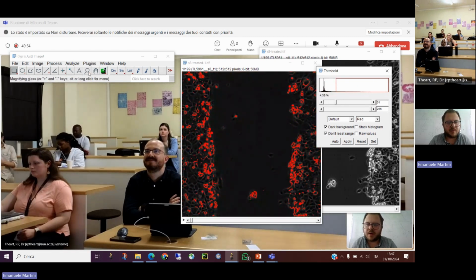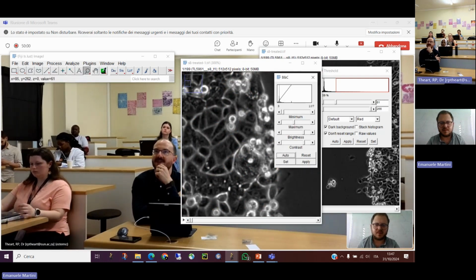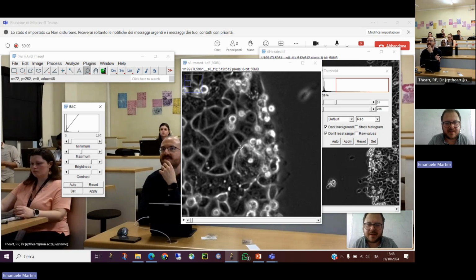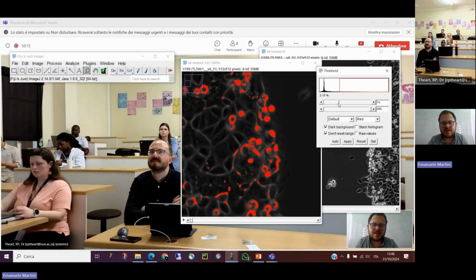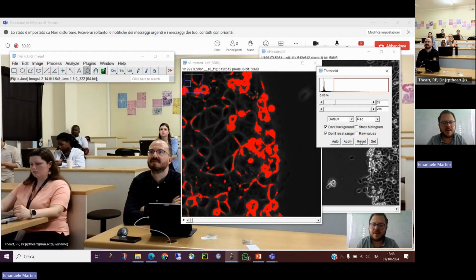Because what's the problem is the contrast is a little bit low. Okay, now it's okay. You can see that inside the cells is quite gray, and then you have the borders, the membranes of the cell. So finding directly a cell thresholding like this will not be easy, and it will not work, let's be honest.